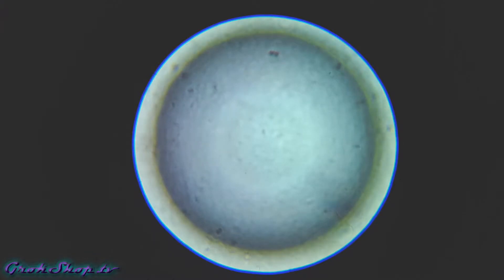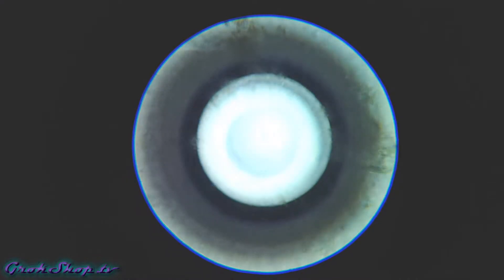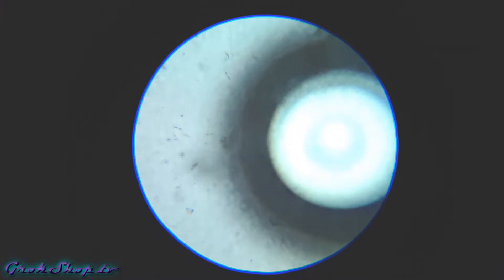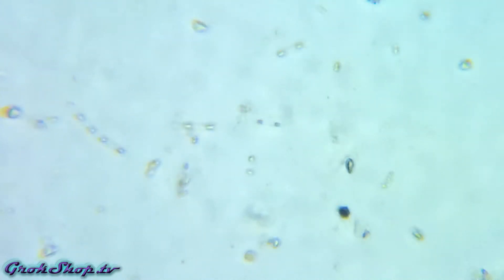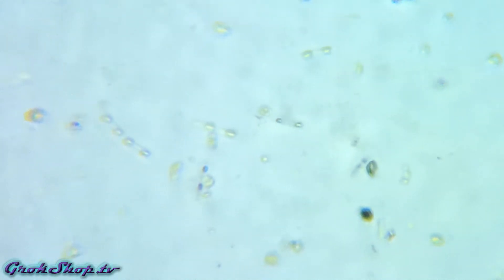This is just great watching this - you'll see these ciliates tossing themselves up on the bubble and trying to get up on top of that thing as much as they can, sort of bouncing off. And here it looks like we've got some binary fission or mitosis going on - some of those spheroidal flagellates look like they're splitting. This must be occurring all the time to get the vast quantities of flagellates we want to get.